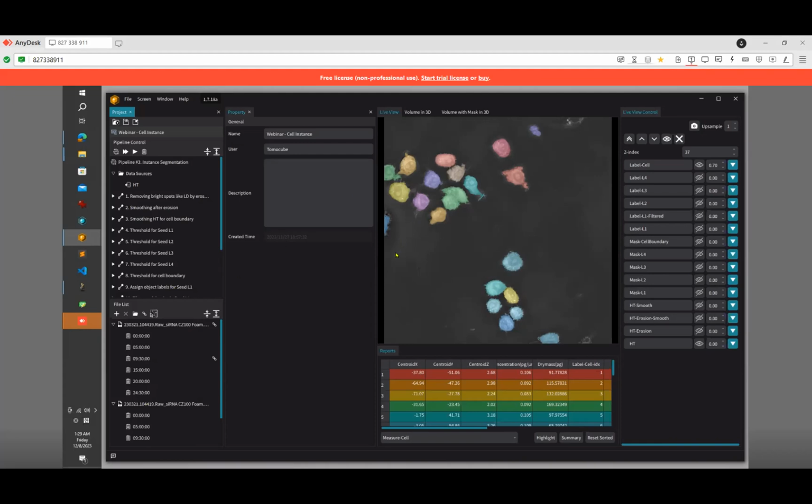And I'd like to get some questions, if there are any. Well, actually, some people gave questions online. So the first question is: will the cell instance ID be conserved when performing segmentation across time points? Oh, that's the question that I just answered. So it's about the tracking.